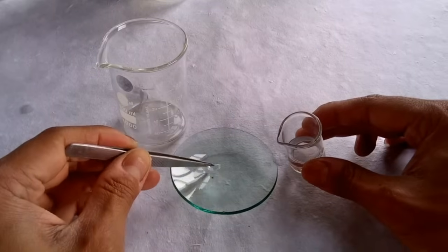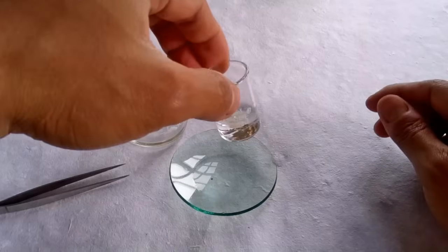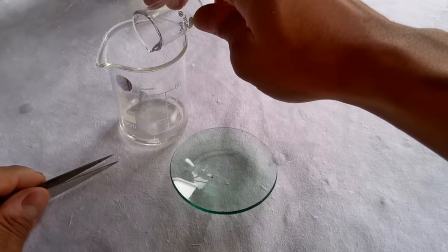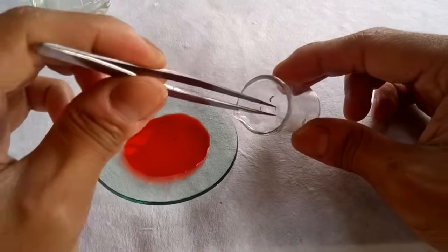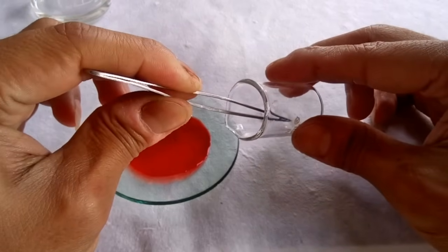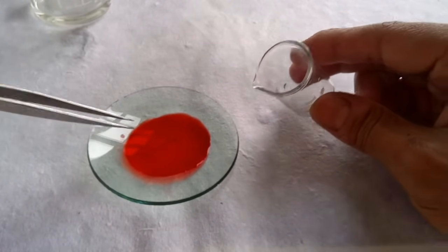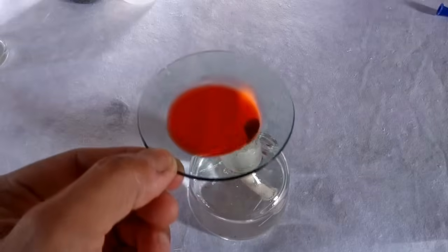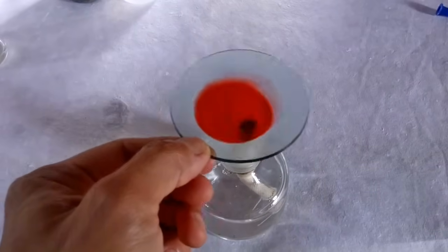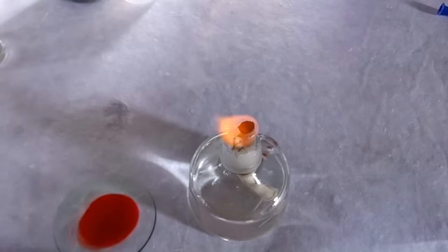Give the root tips a couple of washings in distilled water. Now transfer the roots onto a watch glass containing aceto-carmine or aceto-orcein stain. These are excellent chromosomal stains and will impart a deep red coloration to the nuclear material of the root cells. Warm the stain on the flame for about 5 seconds and leave the root tips in the stain for about 5 to 10 minutes.